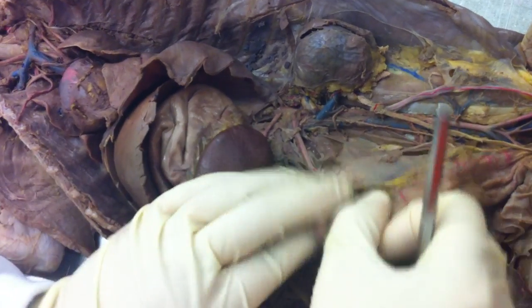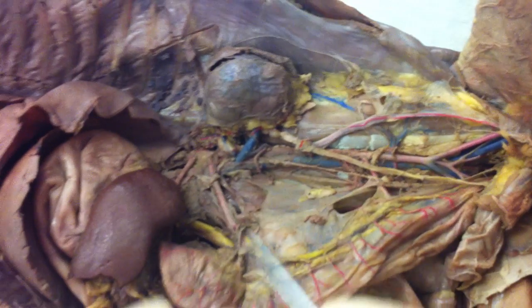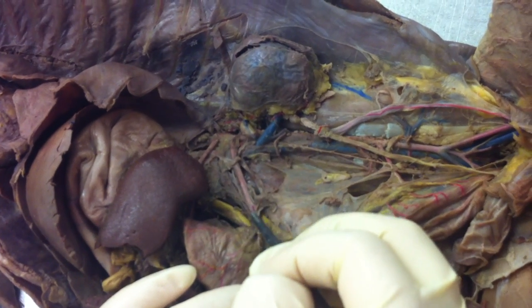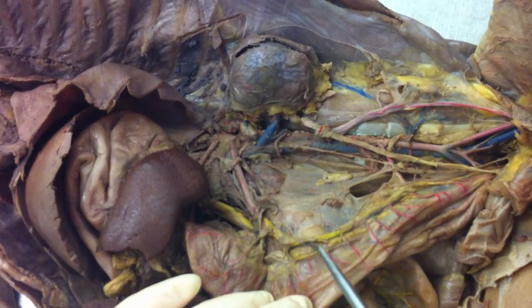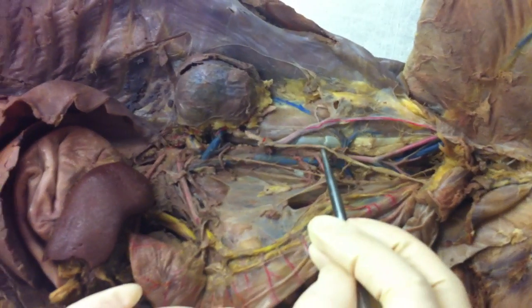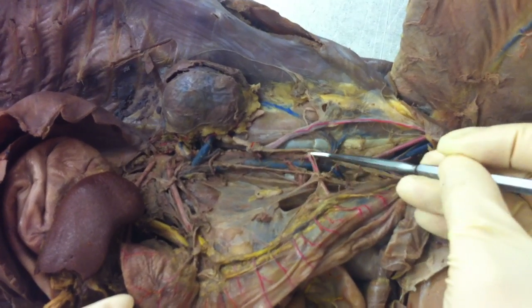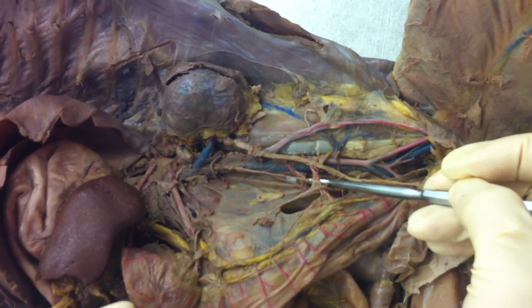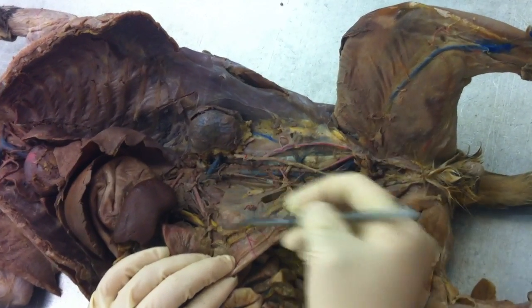And if there's a superior one, guess what? It's an inferior one. There's an inferior one. Here's our large intestine, right? The superior mesenteric branches off and starts to serve the rest of the small intestines down in there. But a branch also loops around underneath all this yellow stuff and comes back to the dorsal aorta, making almost like a complete loop there. This is that inferior mesenteric. Okay? Is everybody good with that?